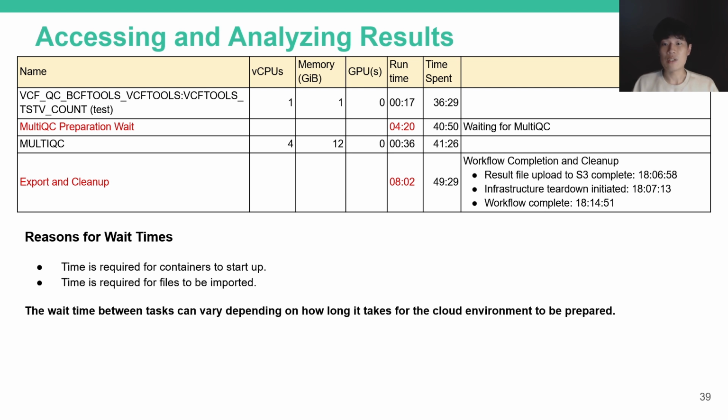This is an inevitable part of using a serverless service like HealthOmics, but if you run the workflow with a large input file, the big advantage is that you can access a high performance computing environment without having to buy and set up the physical hardware yourself.